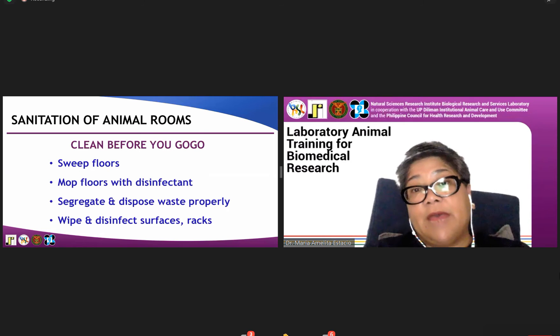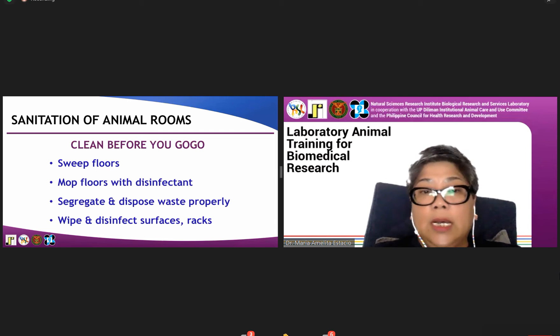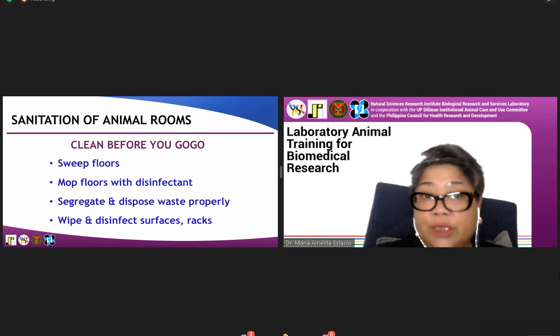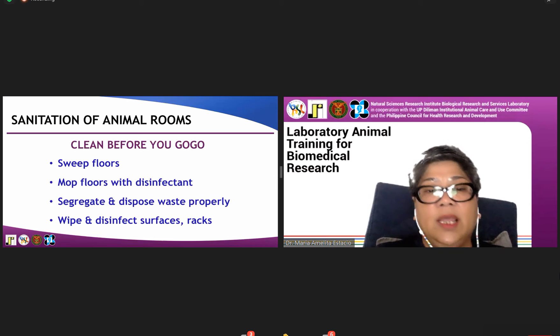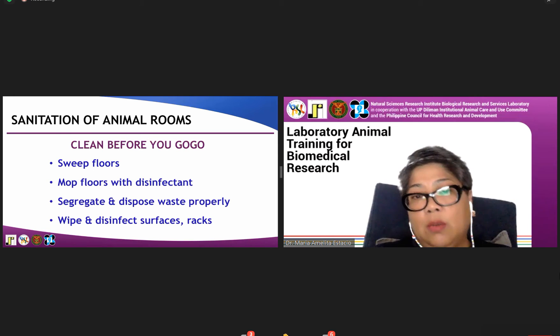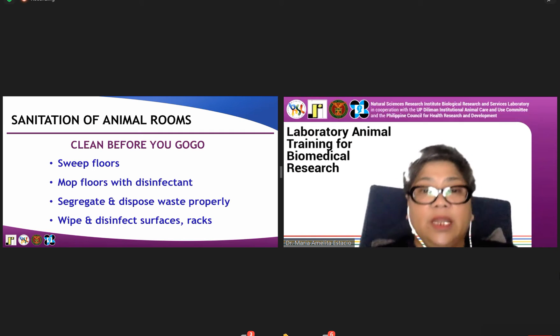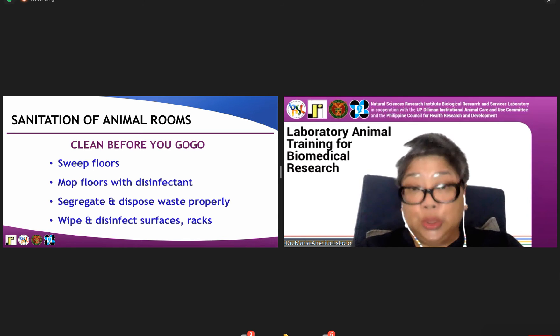For sanitation of animal rooms, this is my mantra: clean before you go. Every time you enter the lab animal room and perform a procedure, you need to clean it — sweep the floor, mop the floor, segregate and dispose the waste properly, and wipe and disinfect working tables or areas, so that the next person is ensured a clean environment.